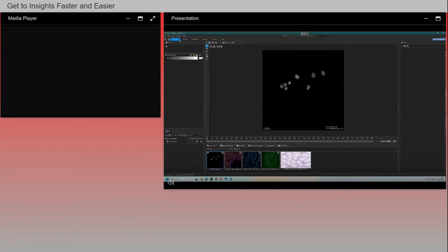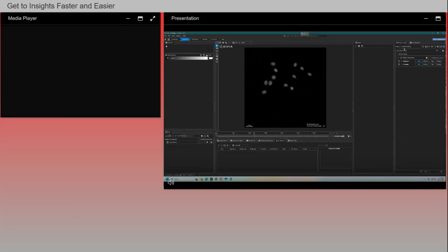As I described earlier, in this time-lapse image, which is in 2D, when I move to the detection step, it already recommends the optimized recipe, which is in this case nuclei tracking, and it also suggests steps for classification, relation analysis, as well as exploration, with the layout shifting to make it optimized for a user.